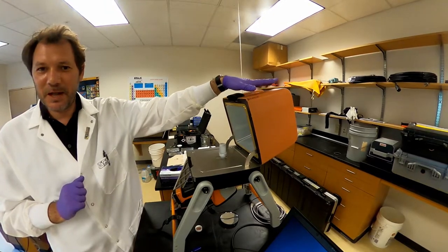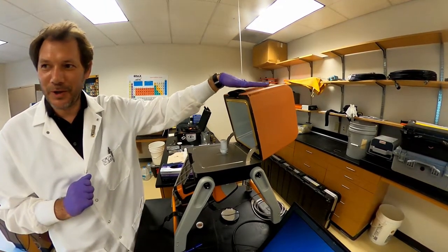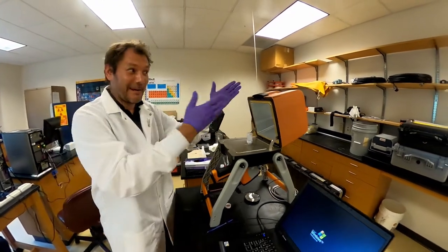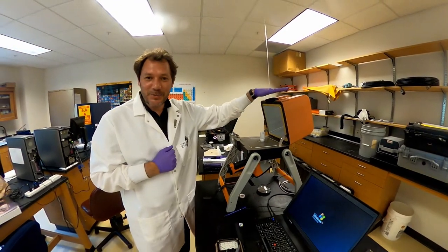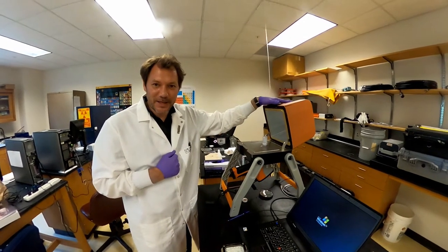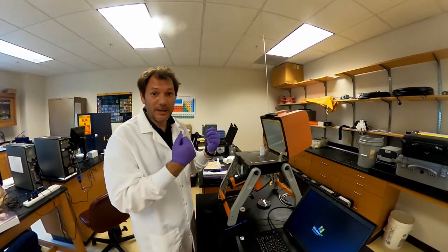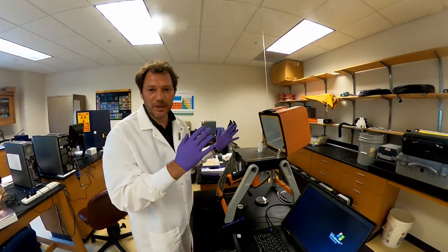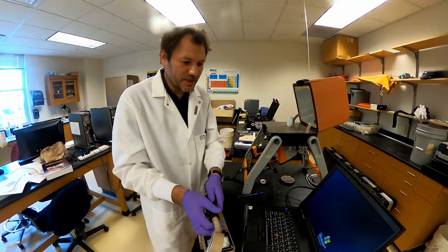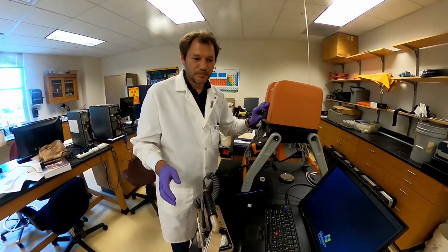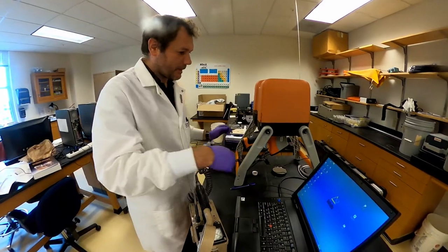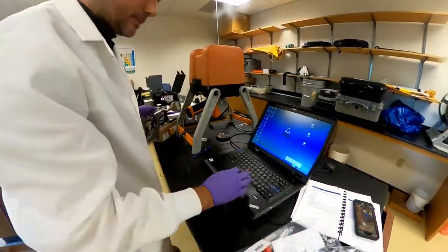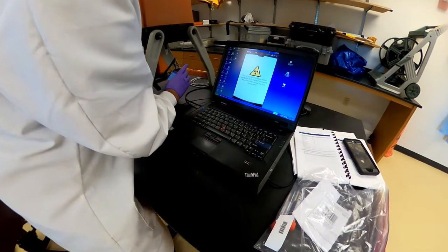So we just put the sample on top of this opening so that we can analyze it. This is made of an element that you know very well, which is lead. Because lead, as we know, is an extremely dense material with a lot of electrons, so it's actually going to absorb the excess X-rays that are generated during the analysis. For safety purposes, of course, I will close the door.